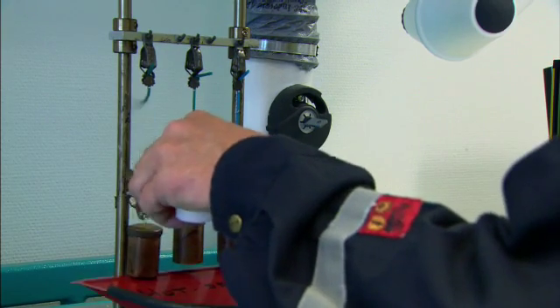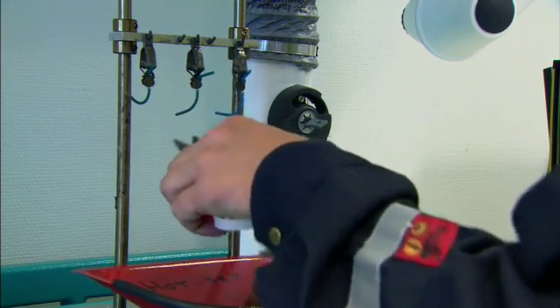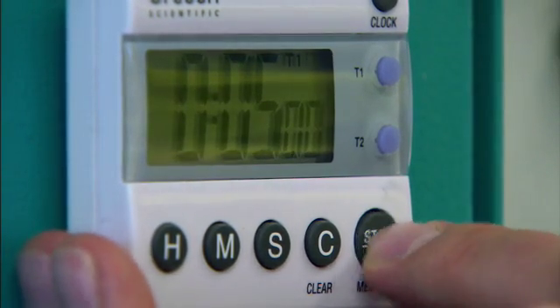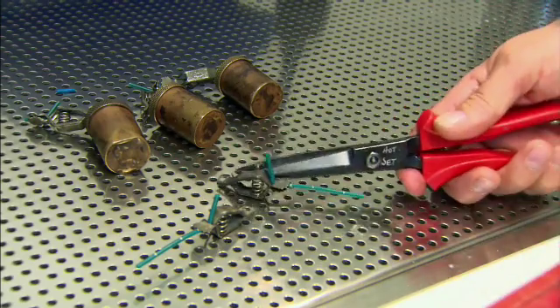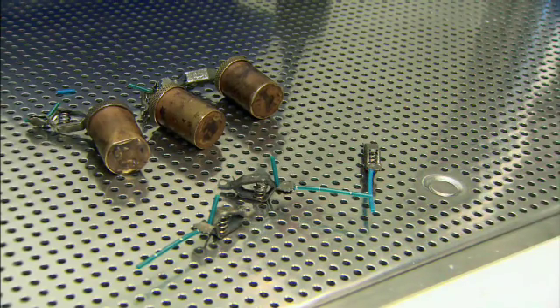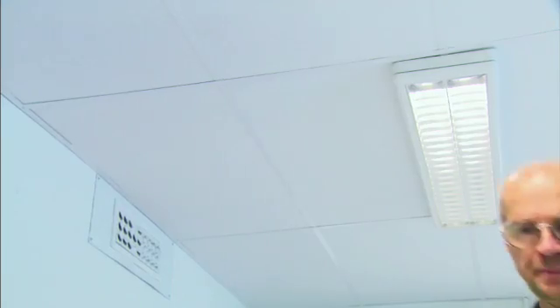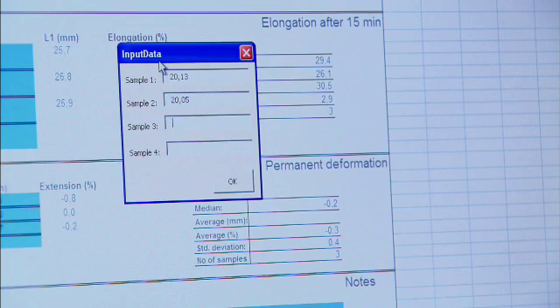Remove the weight and leave the sample hanging in the oven for another 5 minutes. Allow the sample to cool in the ambient temperature. Measure the distance between the markers and calculate the heat deformation.